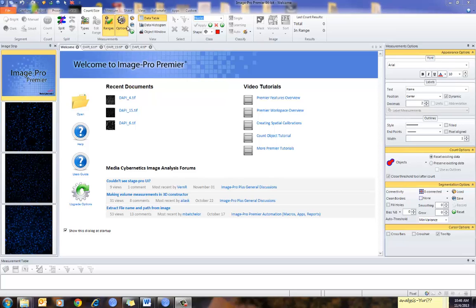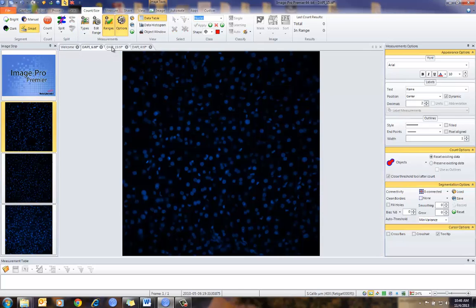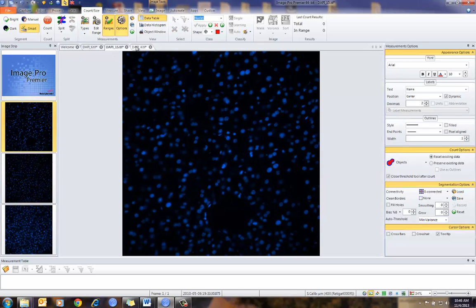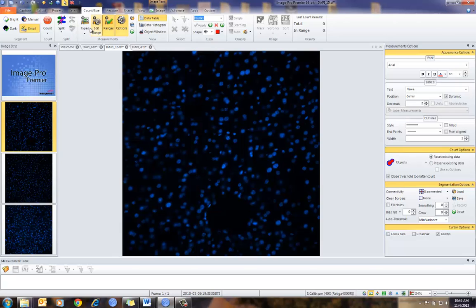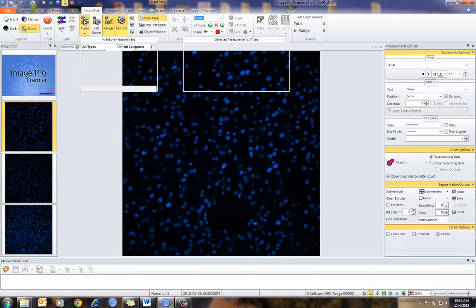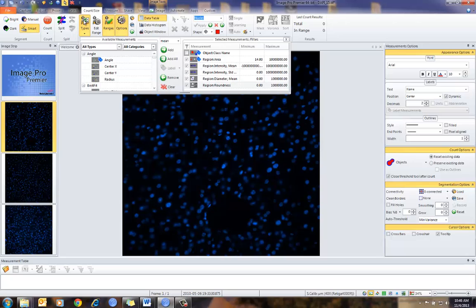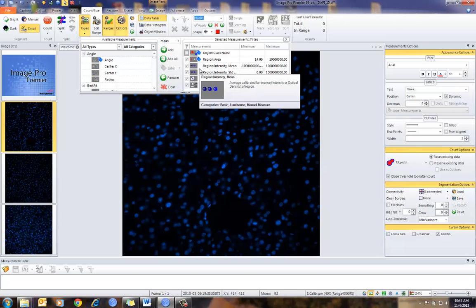So at this point, I'm going to go to count and size and show you the images I have already counted. These are nuclei, and I already have count and size set up. I already have the types of measurements I would like to make — all set up and ready to count.